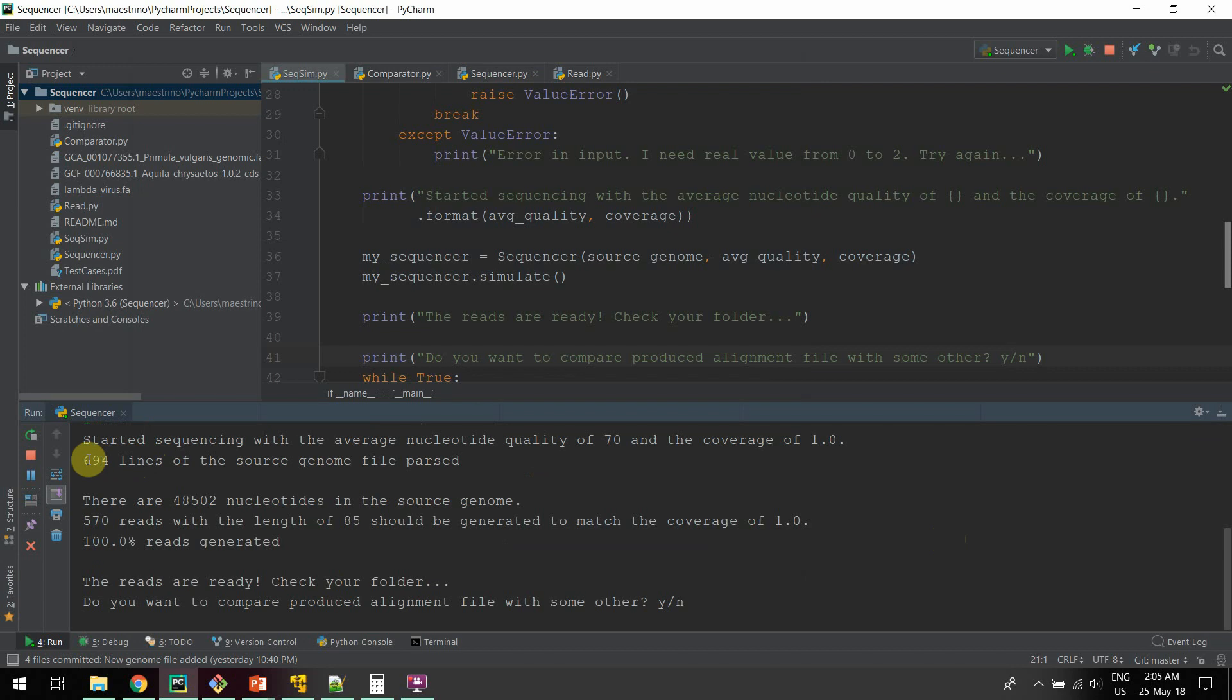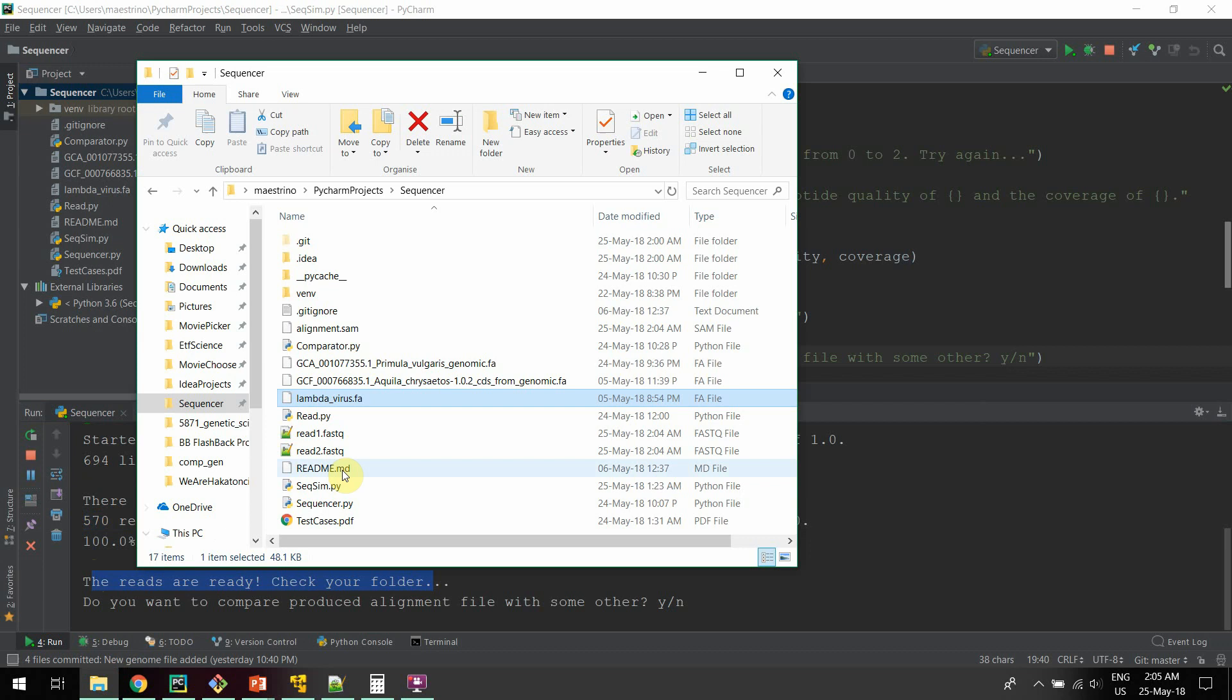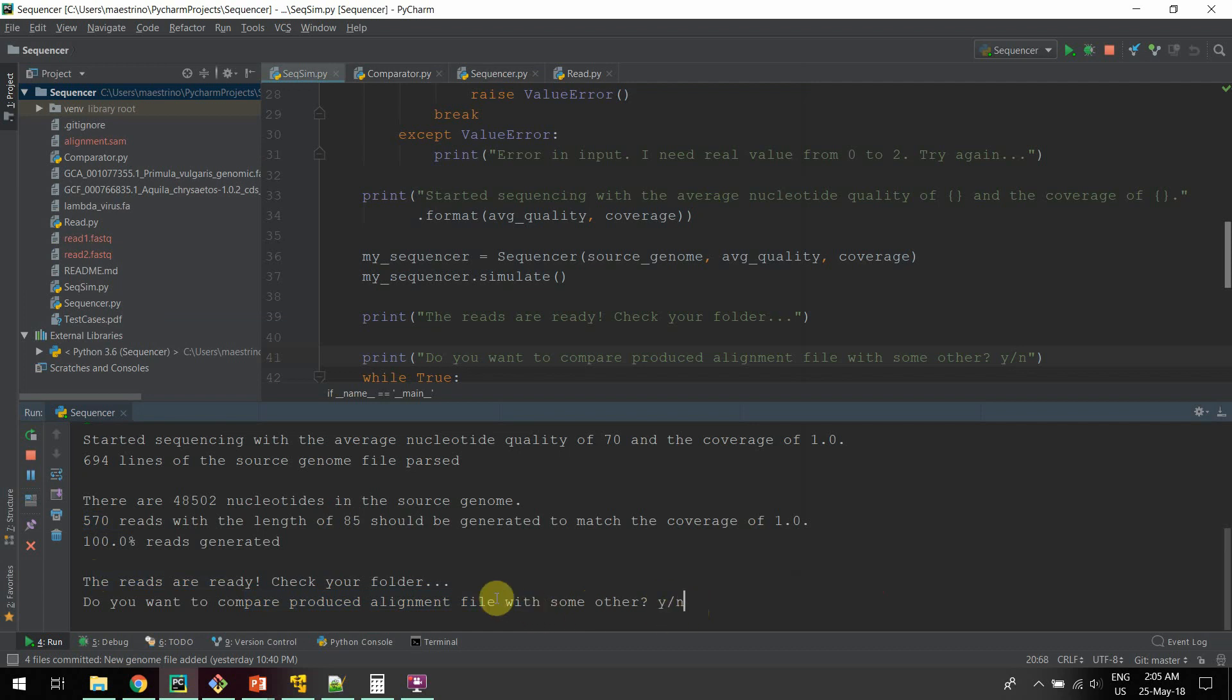Now it says that there are about 700 lines and about 50,000 nucleotides, and with the coverage it says that it should create 570 reads, and that is done. We can take a look at our folder, and there are two FQ files. Now there is the other part of the program. It asks us to compare our alignment file. Yes, we want to do that, but currently we do not have that file, and we will produce it.